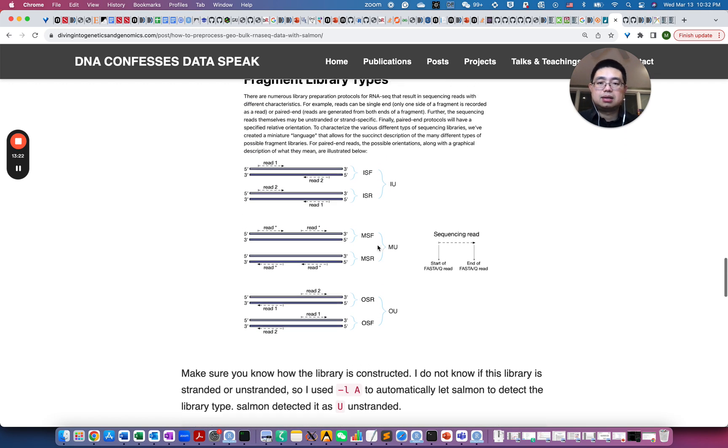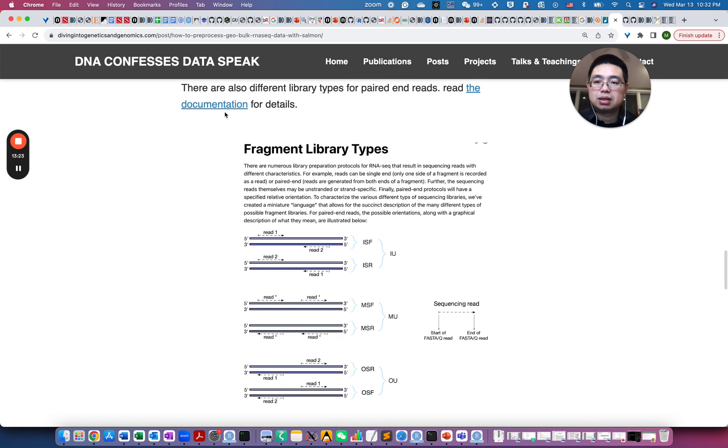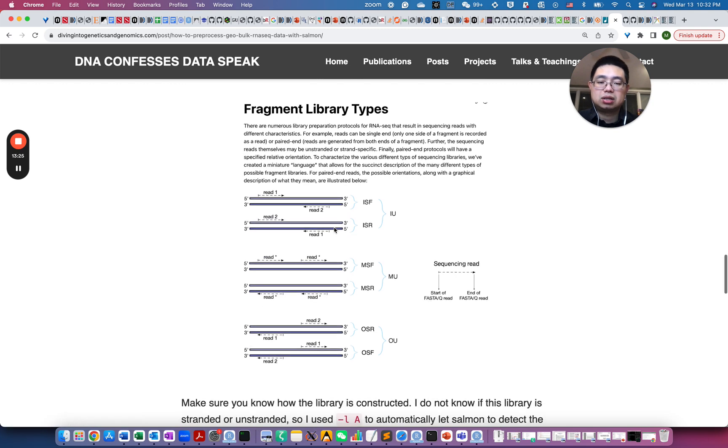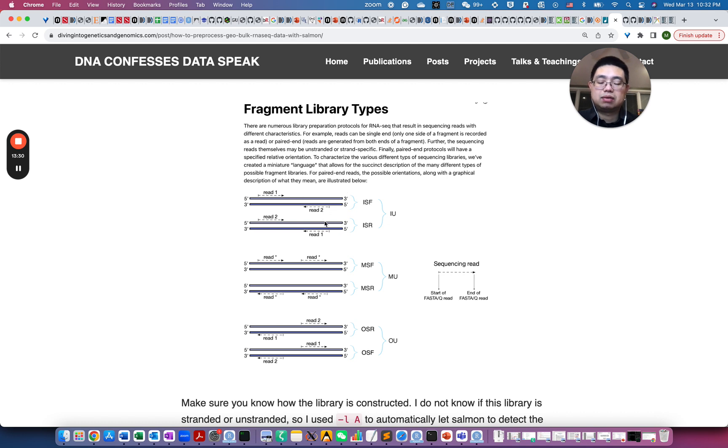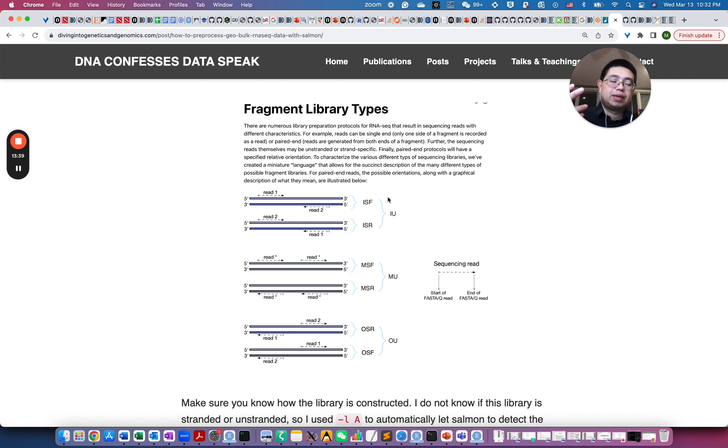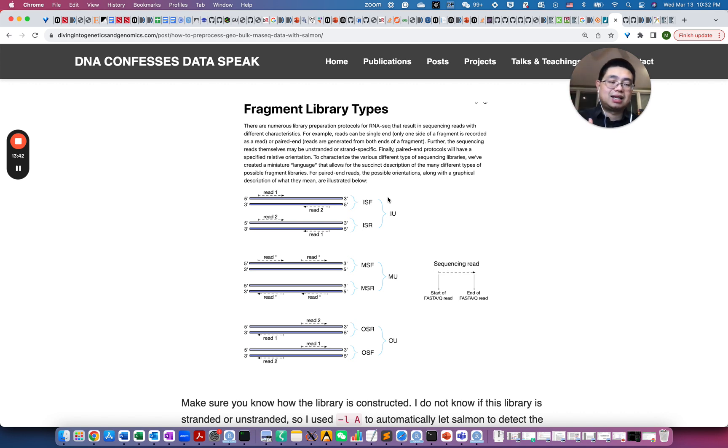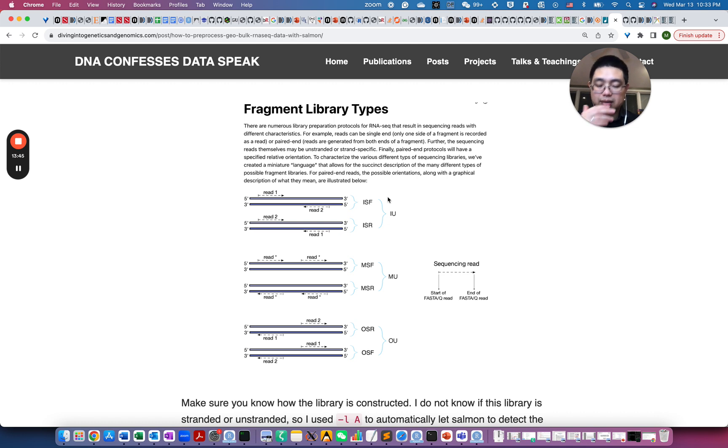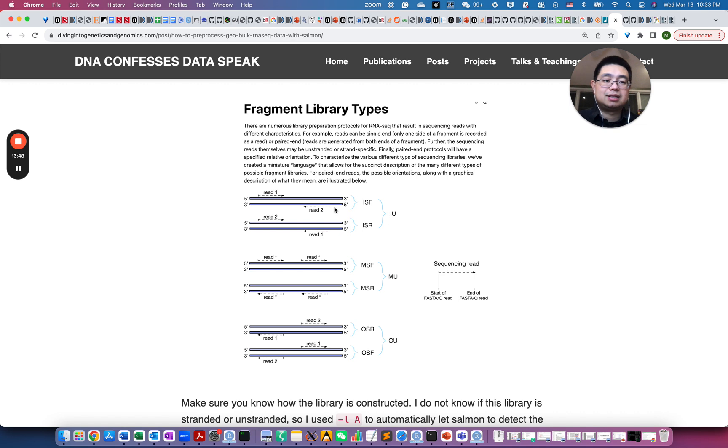So you can go to this link for the documentation. So essentially for paired end reads and also even for single end reads, it can be either, for example, like first strand stranded or unstranded. So stranded means you know whether that read is from the sense or the antisense strand.